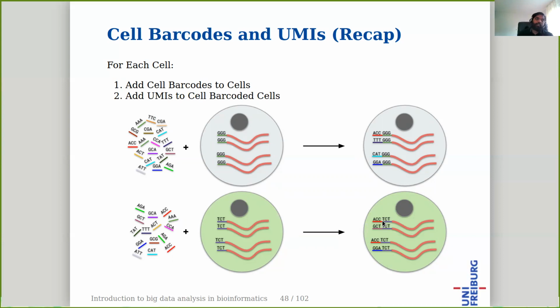That's how we can actually achieve sequencing at single cell level, compared to what we've done in bulk RNA sequencing, where we just put all of them together, sequence them, and then get just an average expression of the tissue. But here we can distinguish each cell with the barcodes and UMIs, and then we get expression levels of transcripts at cell level.